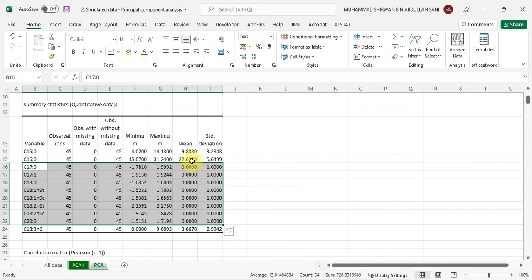Because some people, even reviewers of papers, still ask, hey, your one does not follow normal distribution after transformation, so it should not be accepted. No, it can be accepted, but we have to take note. Not all data will achieve normal distribution when we transform in the first place. It still can move towards normal distribution, but not perfect. So usually I will answer back to the reviewer.